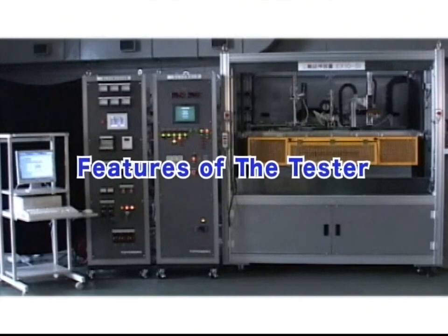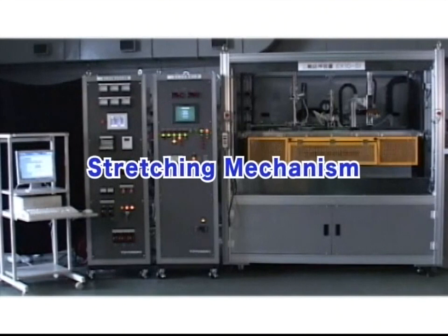Features of the tester are as follows. The stretching mechanism, driven by a combination of a high performance AC servo motor and precision ball screws, allows a wide range of stretch conditions — from low multiplier to high multiplier, and from low speed to high speed.